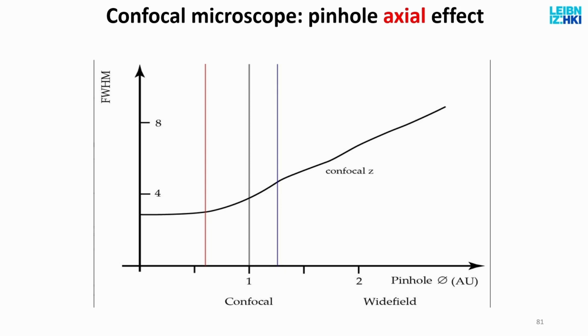And then when the image comes to you, you use the confocal images as a mask to know where you are. Where is the supramolecular polymer, where is the actin fiber, and so on and so forth. And then based on this mask, now you go to the STED microscope image, and now you know, okay, I'm within this fiber. What does my actual structure look like? And where does the fiber start? In the STED, you will not see.